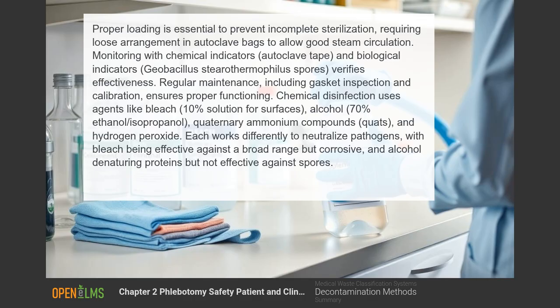Proper loading is essential to prevent incomplete sterilization, requiring loose arrangement in autoclave bags to allow good steam circulation. Monitoring with chemical indicators, autoclave tape, and biological indicators, Geobacillus stearothermophilus spores, verifies effectiveness. Regular maintenance, including gasket inspection and calibration, ensures proper functioning.